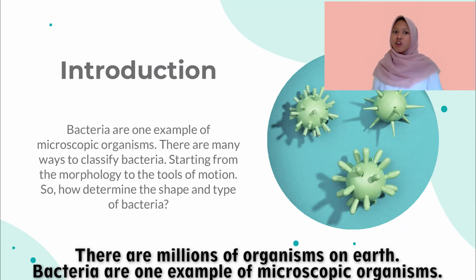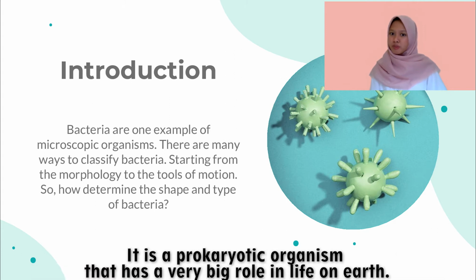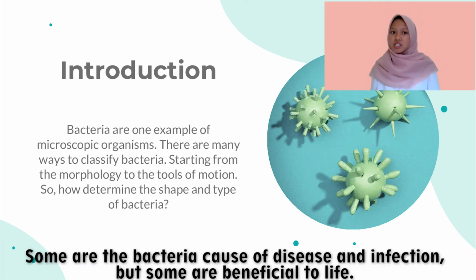There are millions of organisms on Earth. Bacteria are one example of microscopic organism. It is a prokaryotic organism that has a very big role in life on Earth. Some bacteria cause disease and infection, but some are beneficial to life.